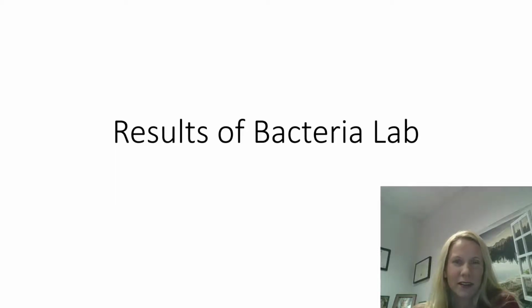We're going to look at the results of the bacteria lab now. I put this into a PowerPoint format and I want to talk to you about what has happened in the last 24 hours as our bacteria has grown in the Petri dish.